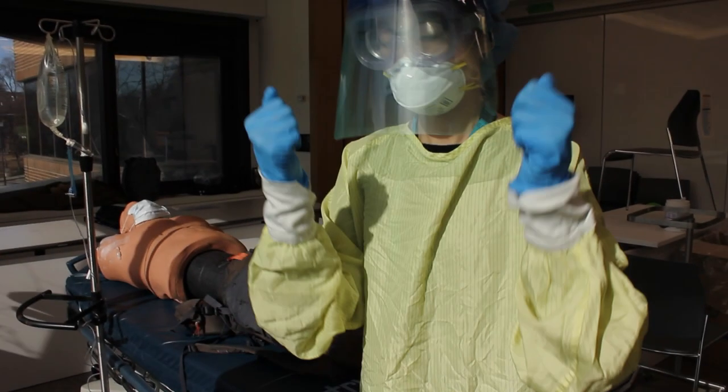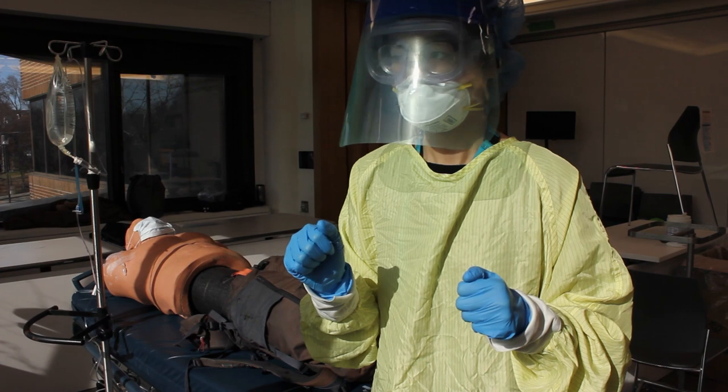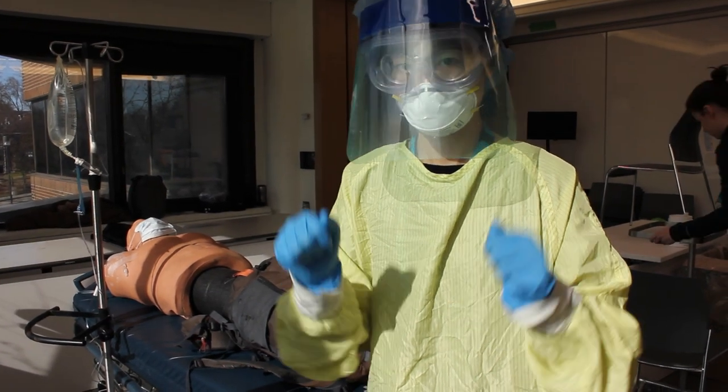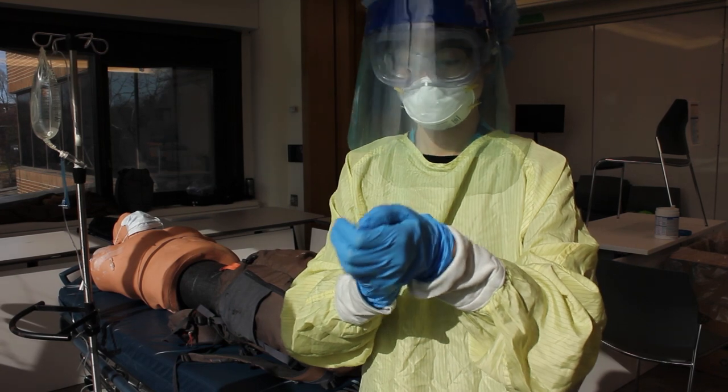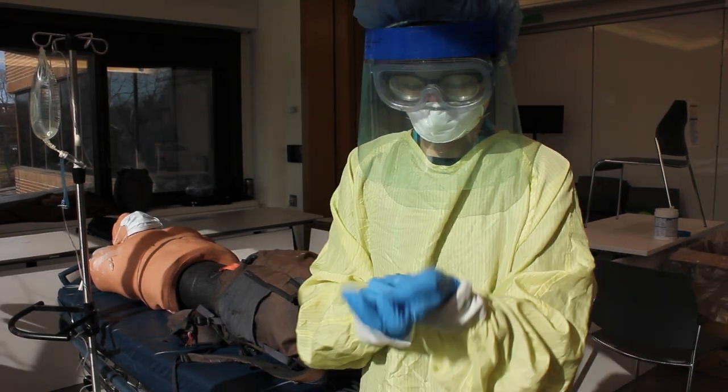We're going through PPE bloopers here. Number one is not having good coverage. You want your gown to be underneath your gloves — tucked well under your gloves. So if you can fix that for me, Nancy.